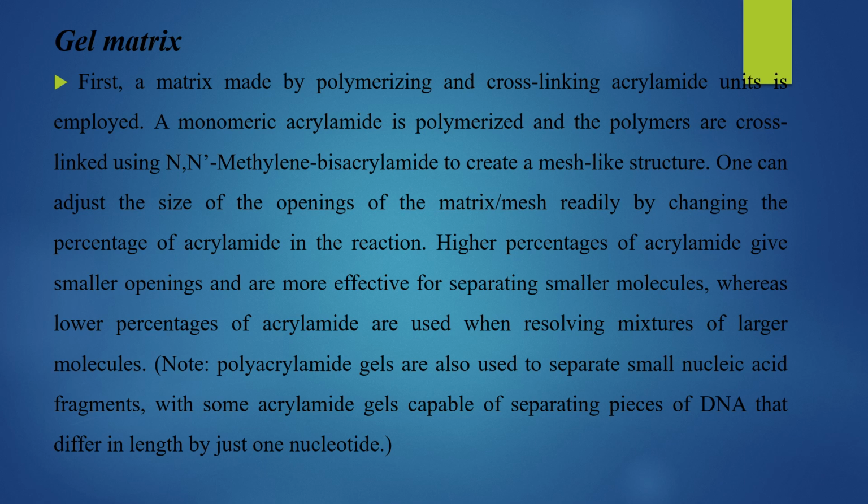Now note, polyacrylamide gels are also used to separate small nucleic acid fragments, with some acrylamide gels capable of separating pieces of DNA that differ in length by just one nucleotide. So although you are thinking more of proteins, you can still use this for nucleic acid separation. Depending on how you do it, you can even separate as small as one nucleotide length difference in nucleic acids.